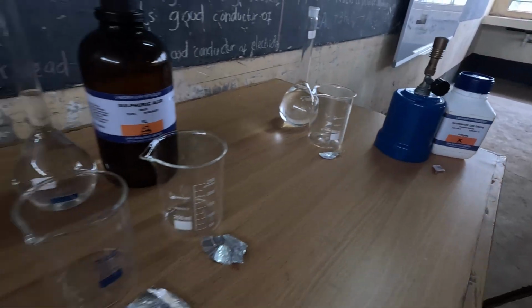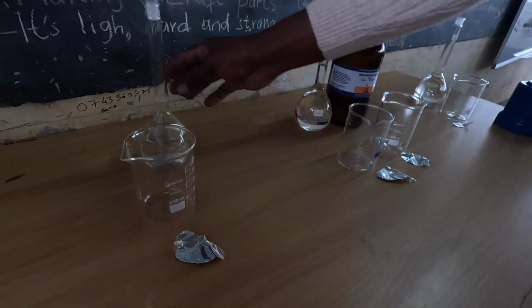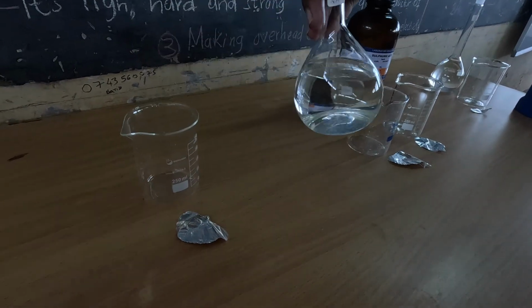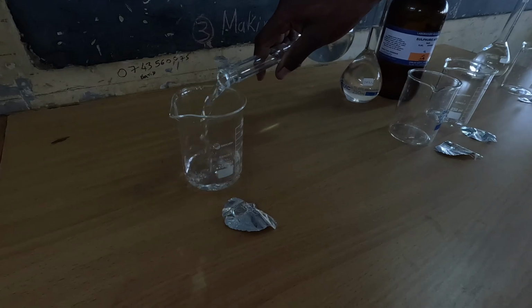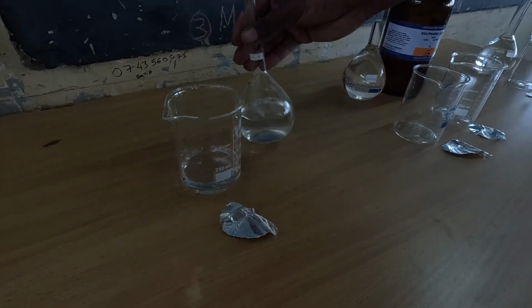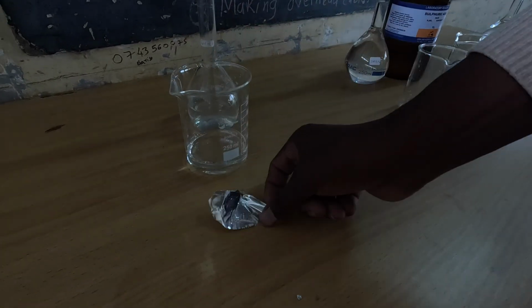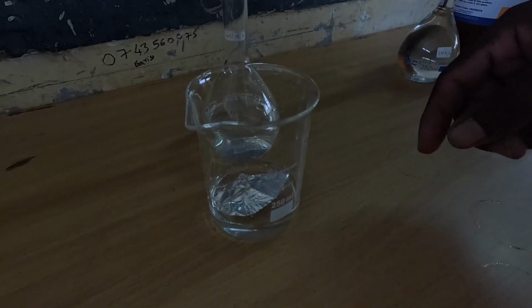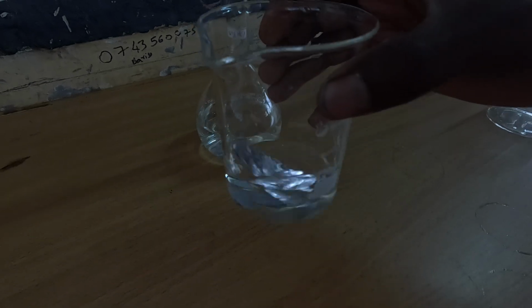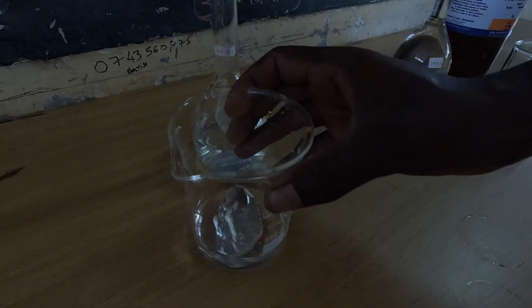Now we are going to do our first test, whereby we are going to place this hydrochloric acid in the beaker like that, then drop this aluminium foil inside our beaker.